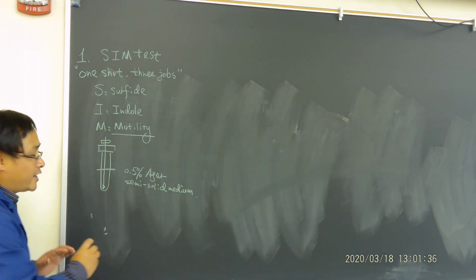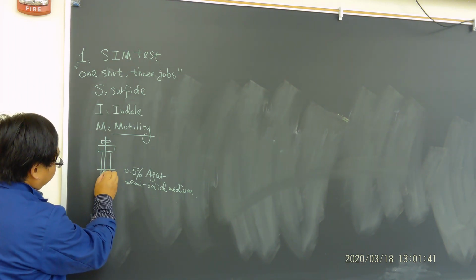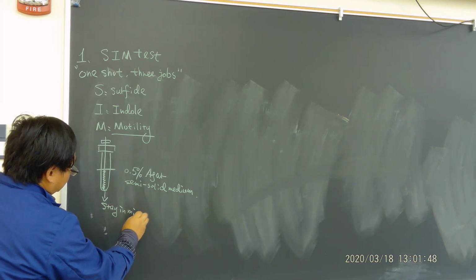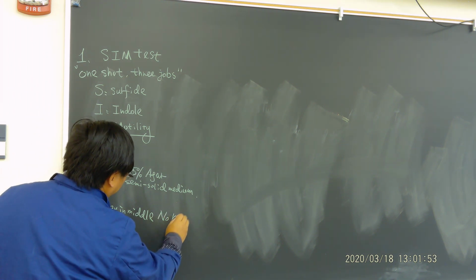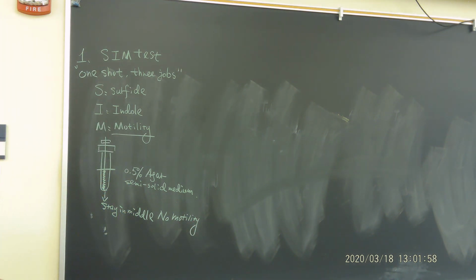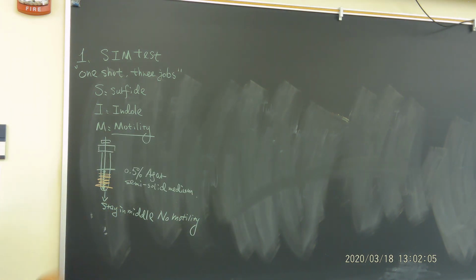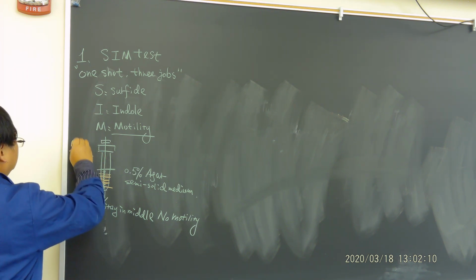We want to see where the bacteria are going to move after incubation. If the bacteria stay in the middle, which means bacteria do not have motility, which means no motility. In other words, if you see bacteria moving around, you see bacteria everywhere, covering the whole tube, that means it has strong motility.